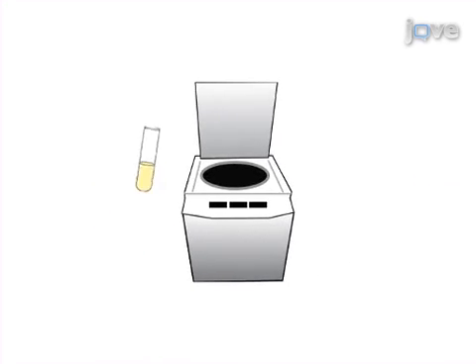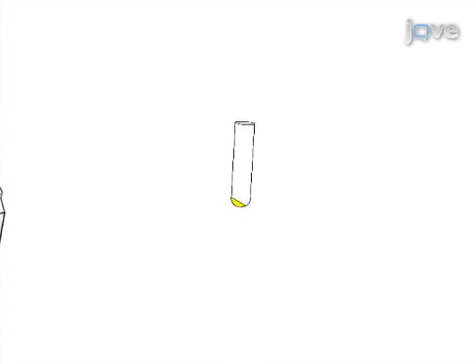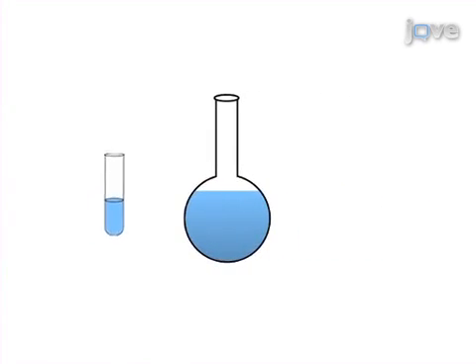Next the bacteria is pelleted by microcentrifugation and the cells are re-suspended in a tris buffer containing SDS and beta-mercaptoethanol. Then the cell lysates are boiled and treated with protease and nuclease.